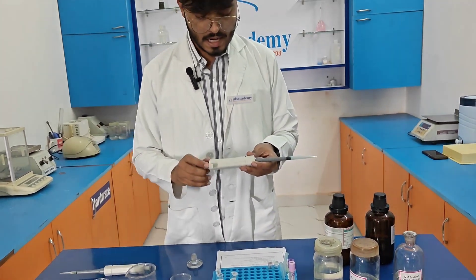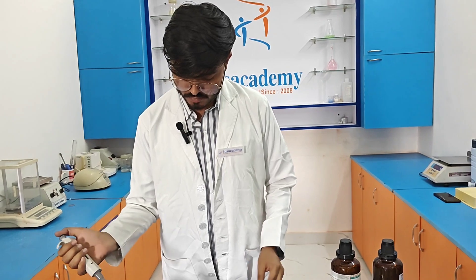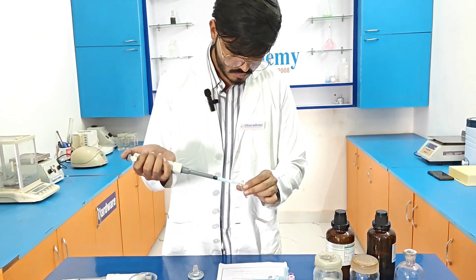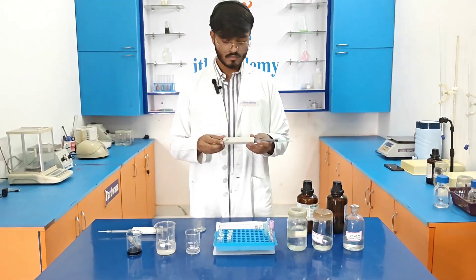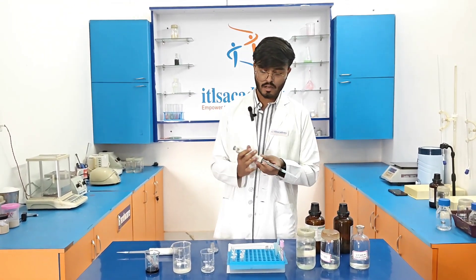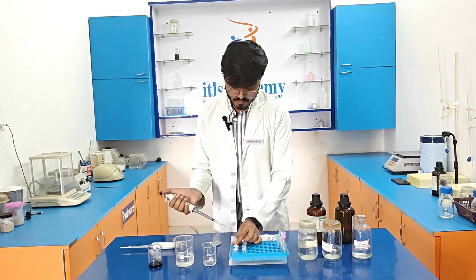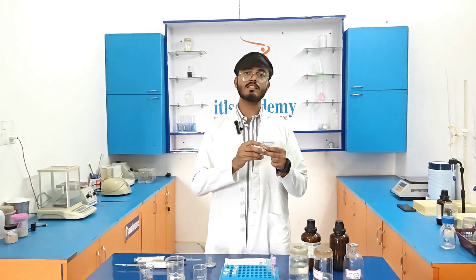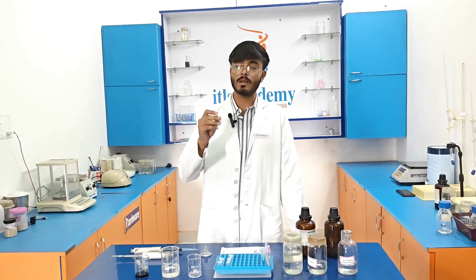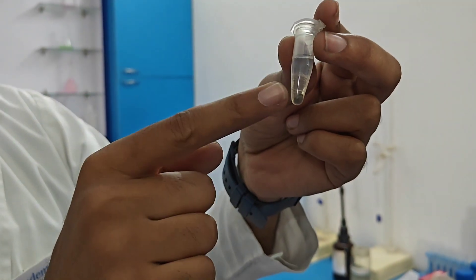Now I am adding 300 µl of distilled water, followed by 400 µl of the chloroform and phenol mixture. After adding all these reagents, we need to centrifuge again at 11,500 rpm for 10 minutes. After centrifugation, you can see in the eppendorf that two layers are observed.